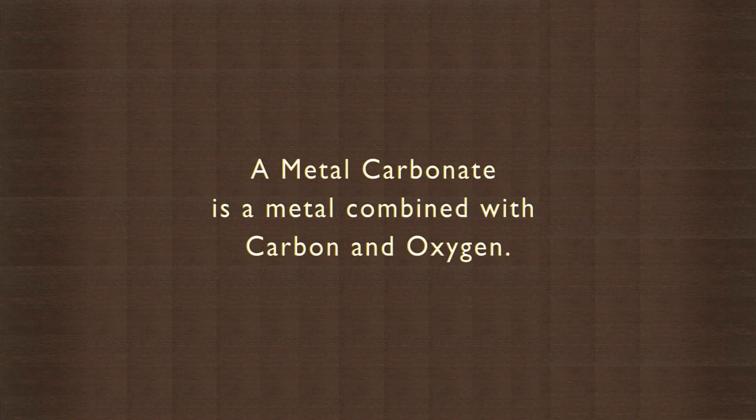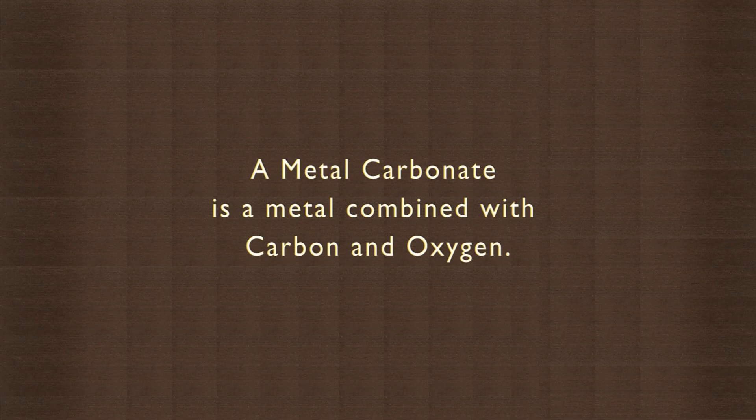Let us try an experiment to see how an acid reacts with metal carbonates. A metal carbonate is a metal combined with carbon and oxygen, like copper carbonate, calcium carbonate.